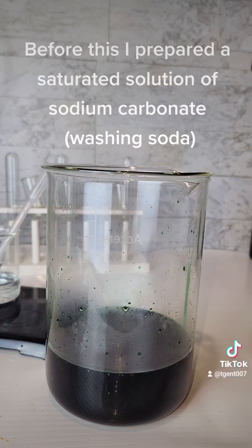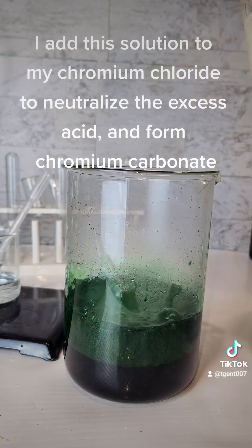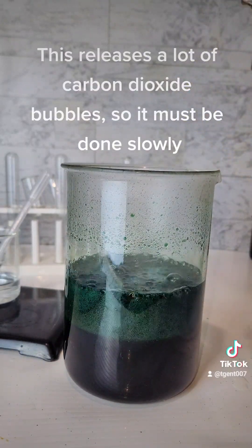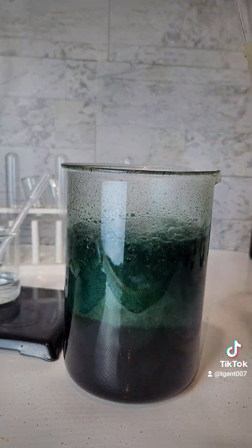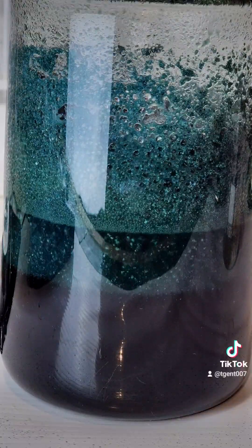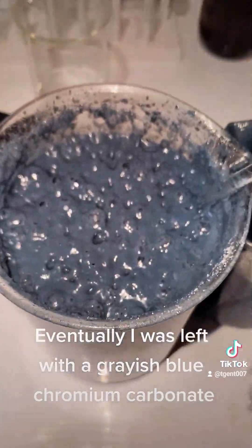Before this, I prepared a saturated solution of sodium carbonate washing soda. I add this solution to my chromium chloride to neutralize the excess acid and form chromium carbonate. This releases a lot of carbon dioxide bubbles, so it must be done slowly. You can see bits of insoluble chromium carbonate precipitate.